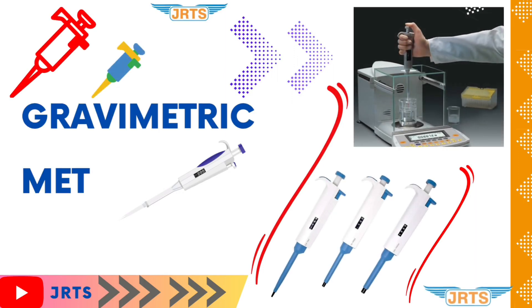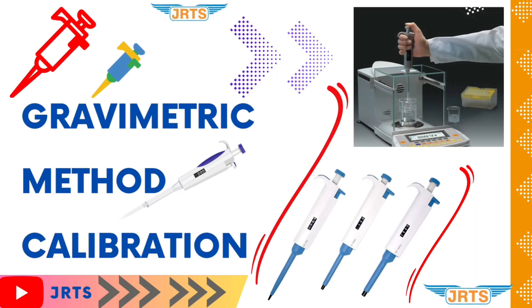Hi all, in this video we are going to see gravimetric method calibration.